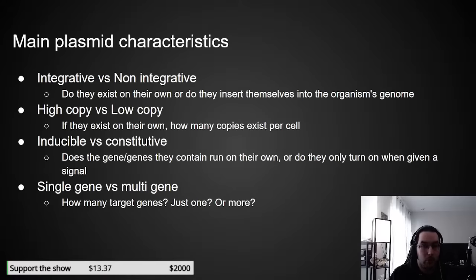But also, the more genes you put in there, the more metabolic burden you're putting on the E. coli, and you'll slow its growth or just straight up kill it, and then it just won't grow. So you've got to be balancing this. So this is, you know, another thing to take into account.